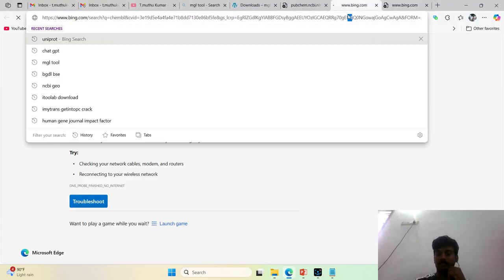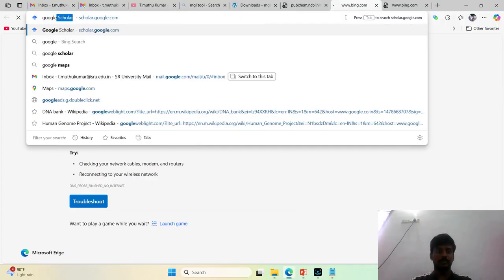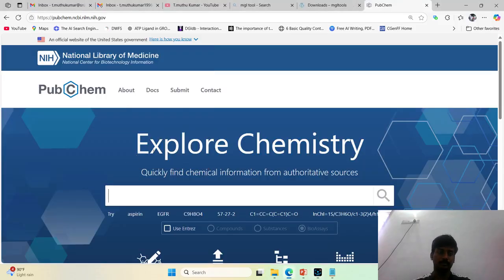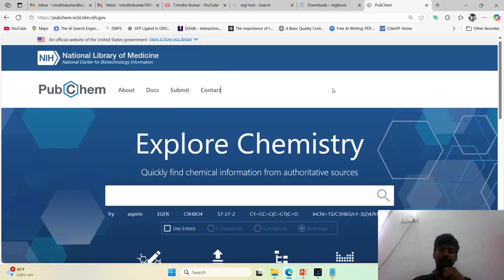Let us wait. Why is it not working? So wait for a second. Yeah, we can continue.